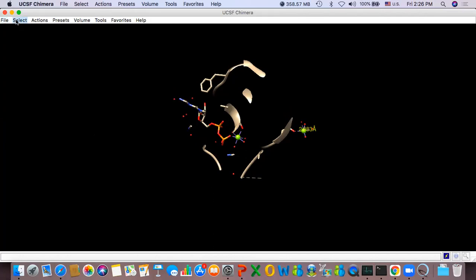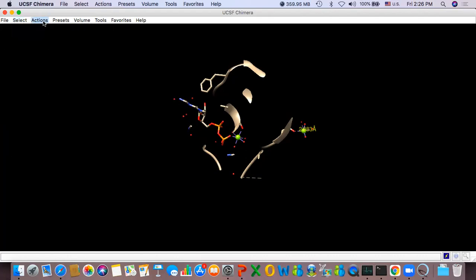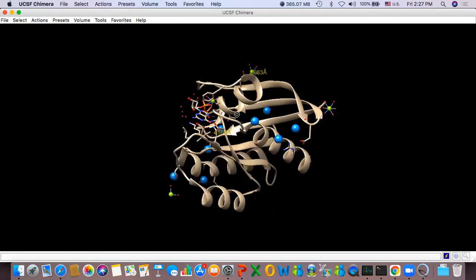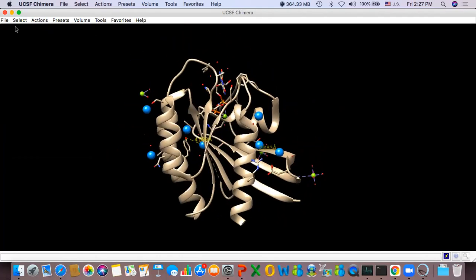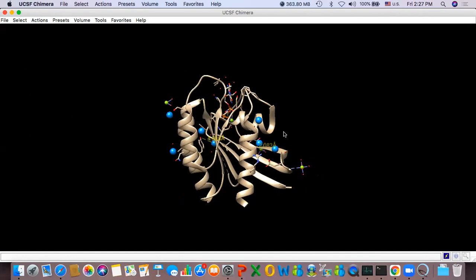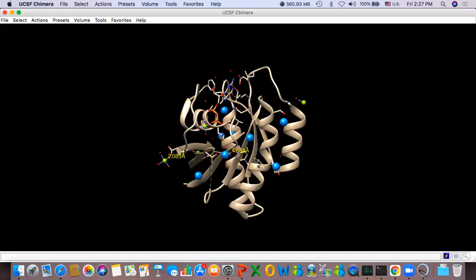It should be in the Actions button actually. So if you clear selection and click focus again, then the other things come back. Yeah, okay. Fine. Yes, sir. Great. Thanks for that, because every single program has its own quirks. So I think it's correct. Clear selection, then set the focus in. So it keeps the protein in the same focus. Okay. That's good. So the point which I wanted to show with this, the distance is fine.